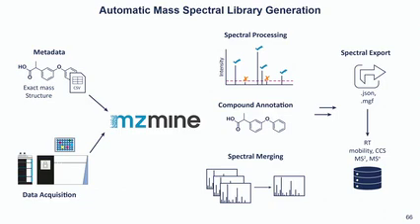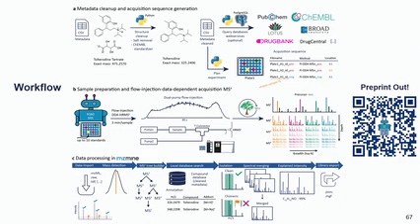In the end, you can export it in different data formats. You can export different information like retention time, collisional cross-section if you use IMS, and of course the fragmentation data like MS2, or in our case we developed an MSn workflow, so we exported multi-stage fragmentation data. And of course this workflow looks very easy and very nice, but there's more behind it, so it's more complex.